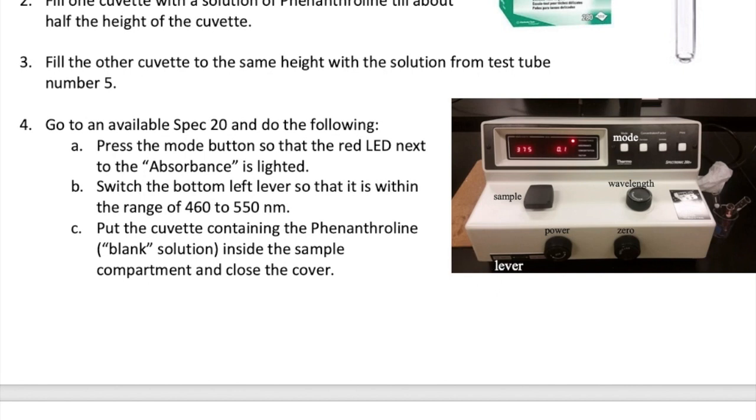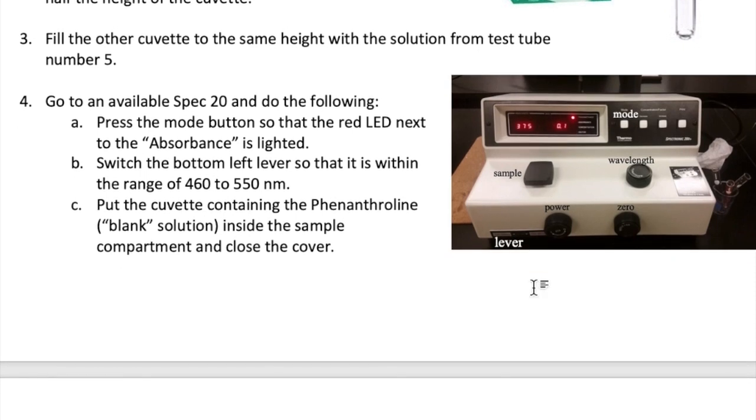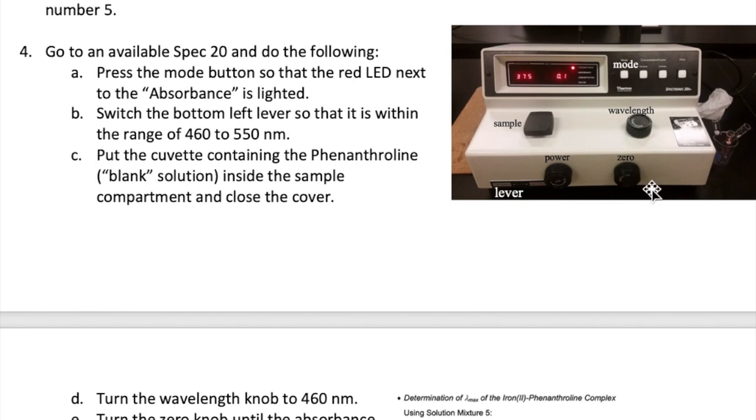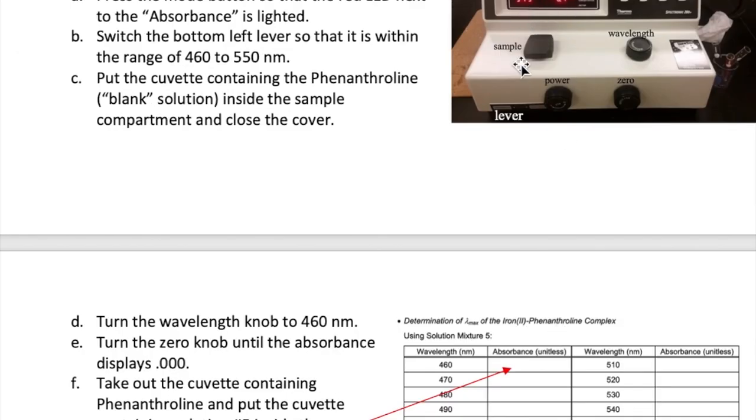Next, take the cuvette that has Phenanthroline in it and put it inside the sample compartment and close the cover. Adjust the wavelength using this knob until it reads 460 here. Then adjust the zero knob until the absorbance reads 0.000. You may need to turn this knob clockwise or counterclockwise for a bit before you see 0.000 absorbance. The process you're doing here is called blanking the spec. This is analogous to taring a balance to set it to zero. In other words, we're calibrating the spec.